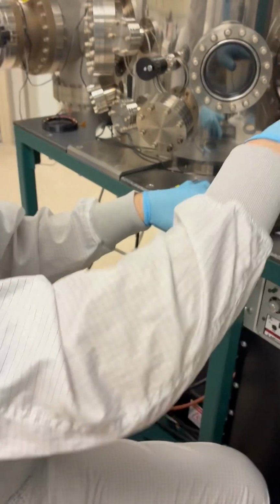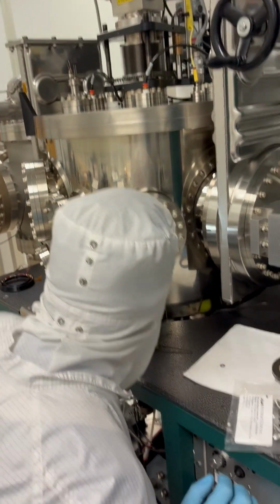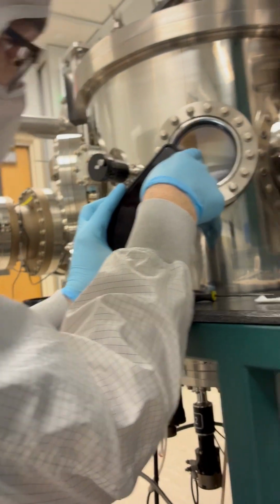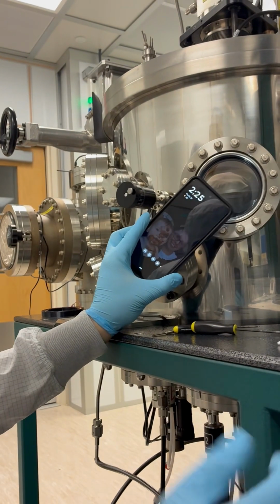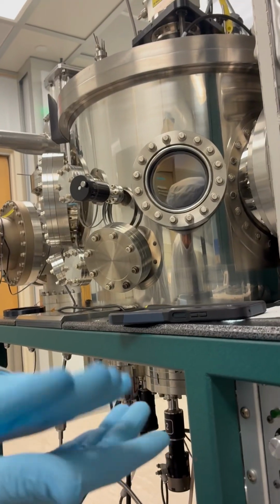I'll show you that again when we're out here. And so I'm going to bring it down. If you look, you can see the pin on the sample holder. It's a little bit rotated too far that way, okay? And that's good when you're in contact with the plate.